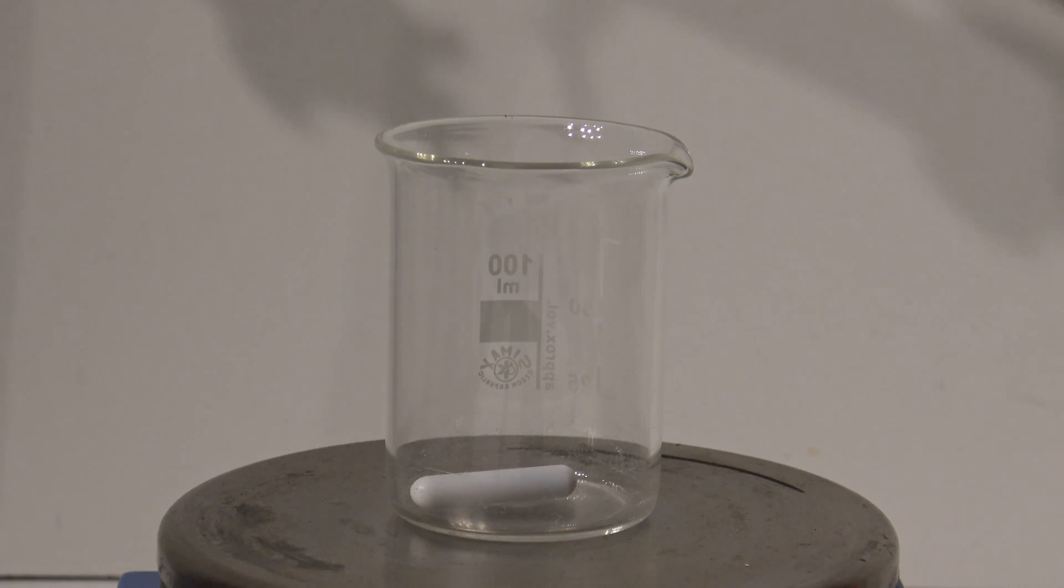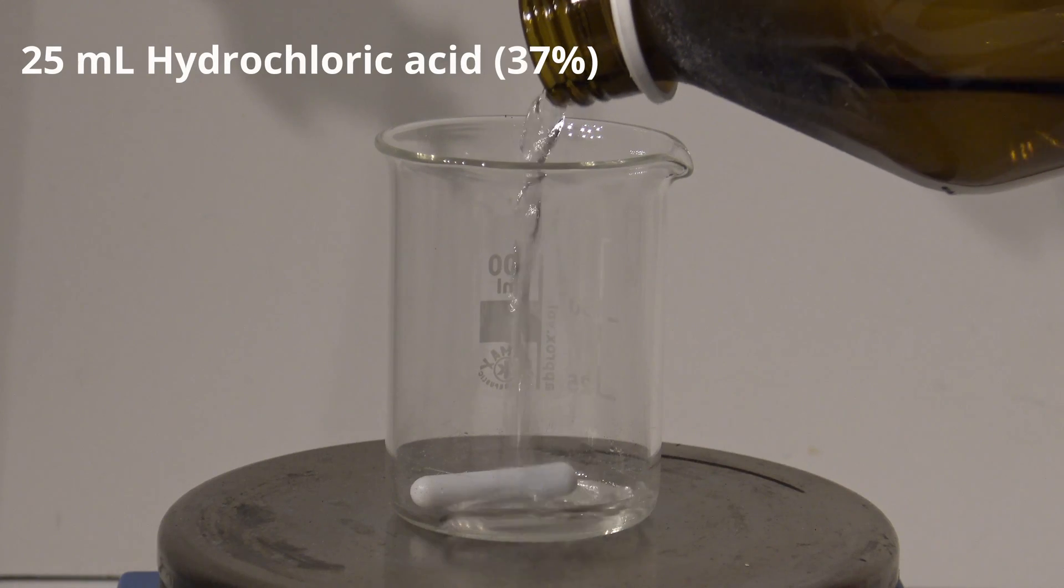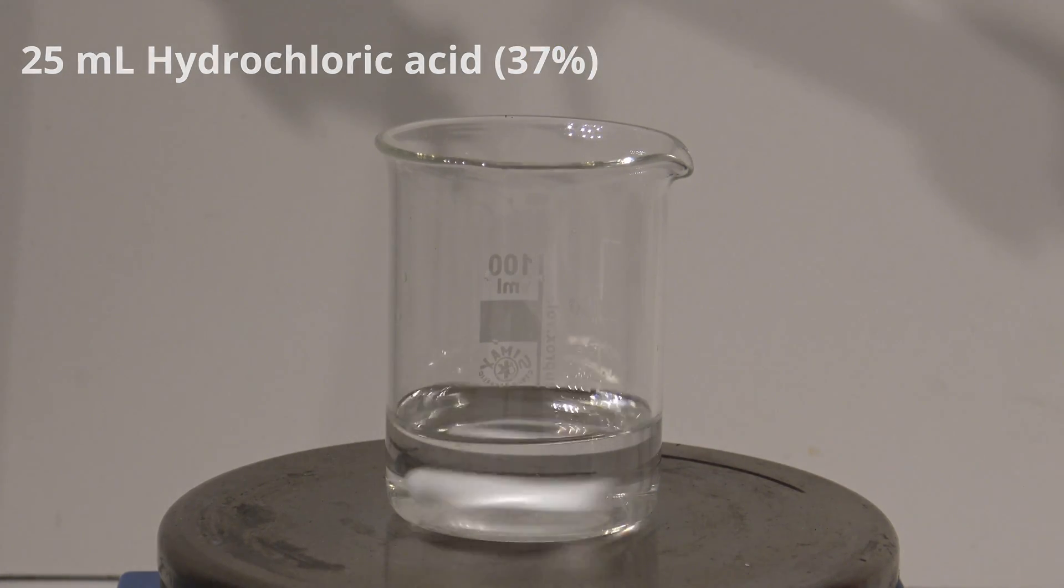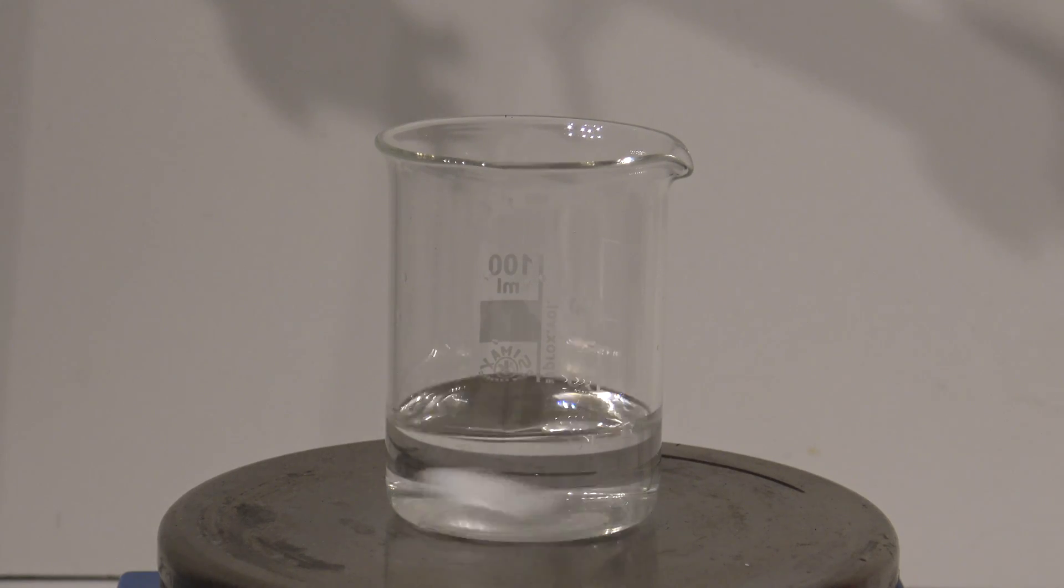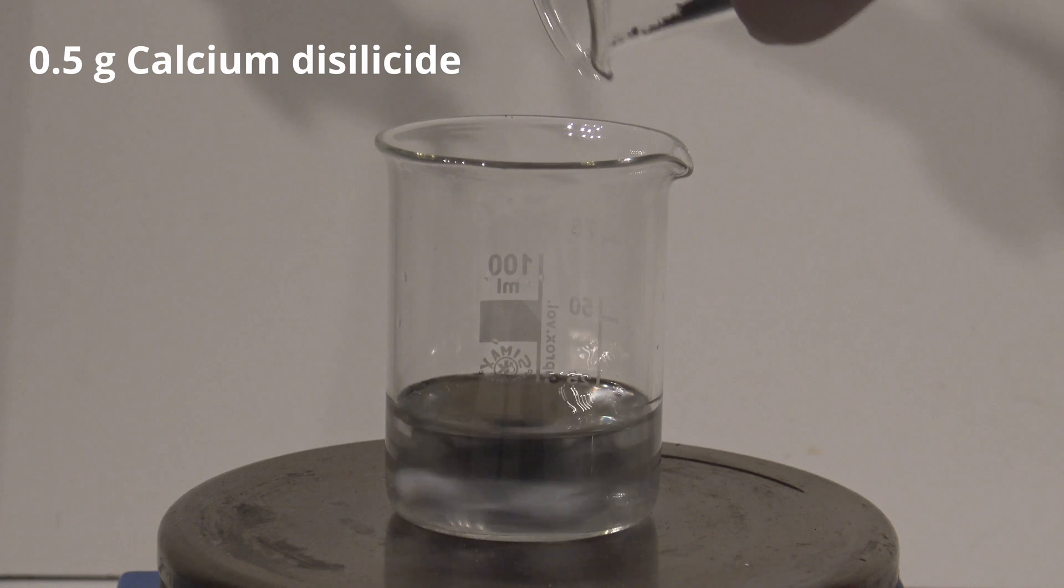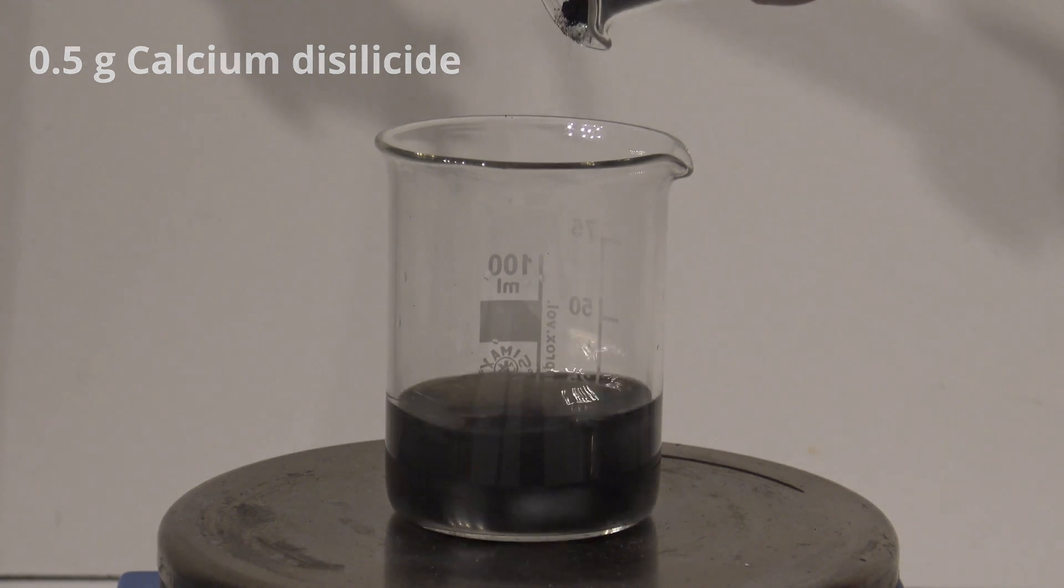An alternative to reacting calcium and silicon is using calcium disilicide in the beginning if available. Here the reaction is way more calm and way less heat is released. This leads to less hydrogen chloride being released in the reaction.